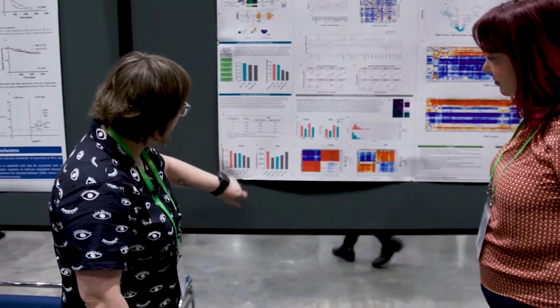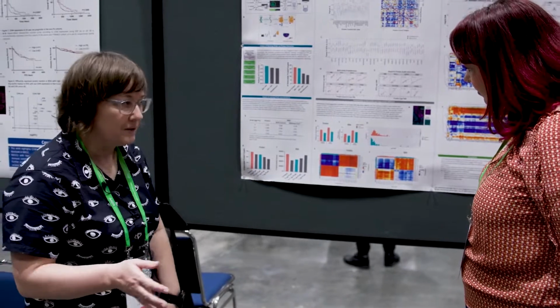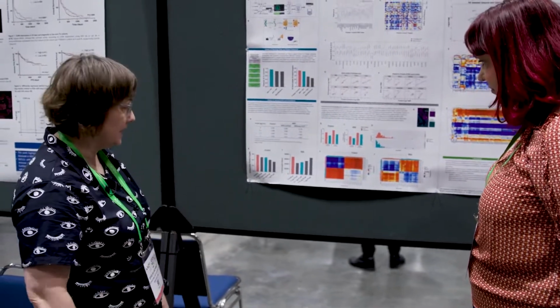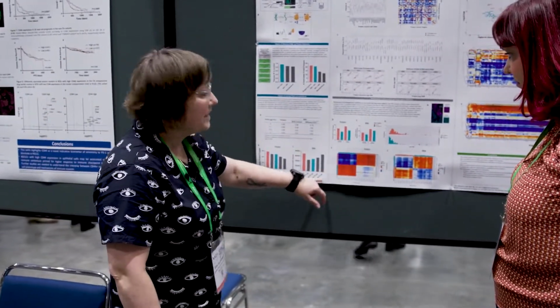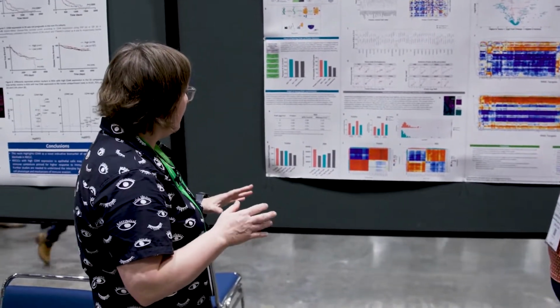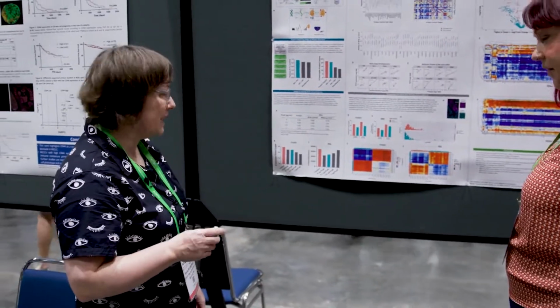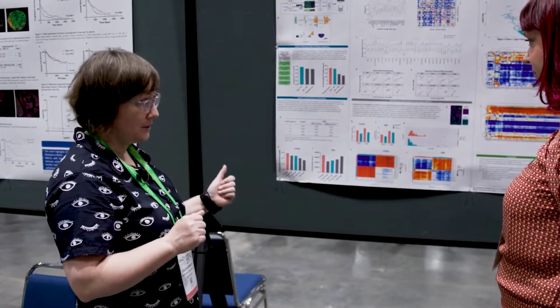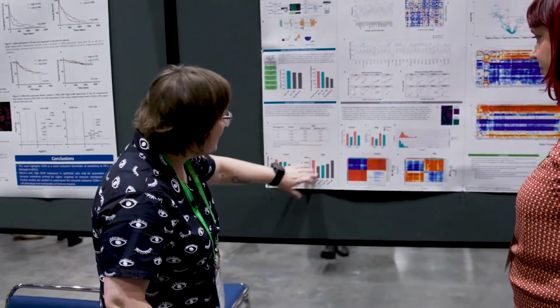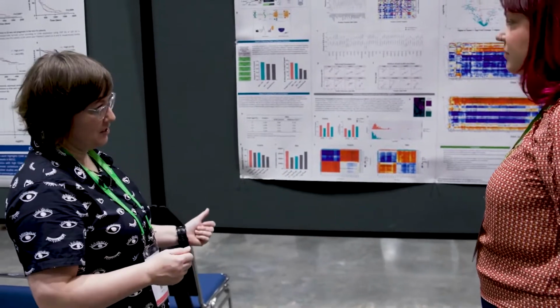We titrated up proteinase K, and as expected, high concentrations are detrimental for protein, while making RNA quite happy. So we decided to go with 0.1 microgram per mL of proteinase K, because we maintain as much of the protein performance as possible while minimizing the impact on RNA detection.